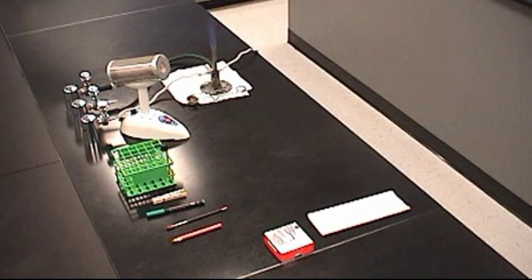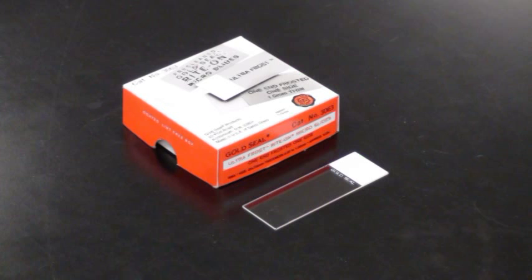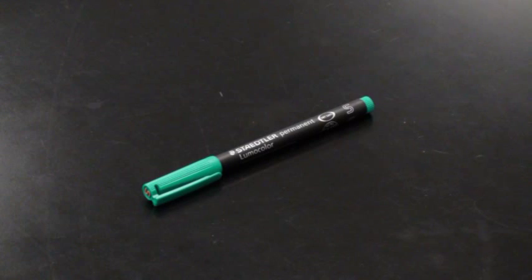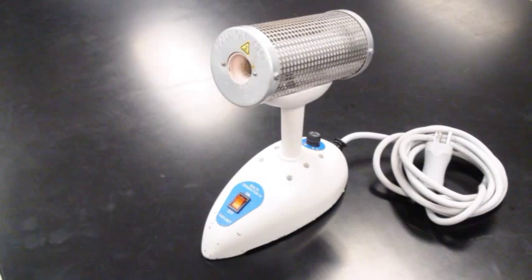To prepare the smear from a liquid medium you need a broth culture of the specimen in a tube rack, glass slide, inoculating loop, permanent marker, china marker, and bacterial incinerator.